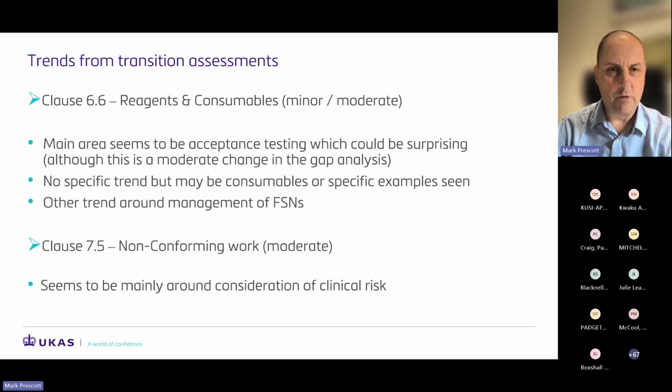Having a look at some of the ones that have been raised, I've seen consumables mentioned a few times. So although acceptance testing of consumables was in 2012, it may be that labs are thinking about this a little bit more now, and so the assessors are more focused on that. But I've also seen some findings around specific examples and gaps in acceptance testing records.